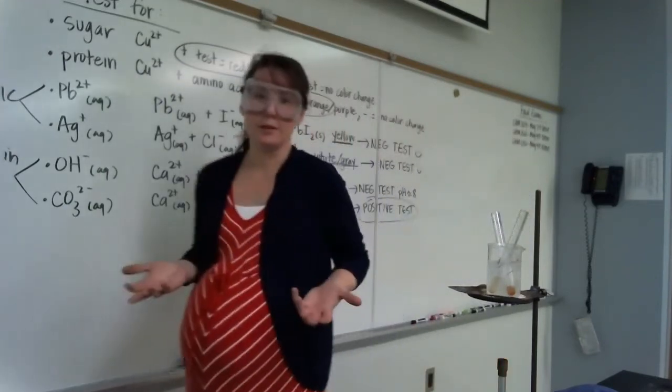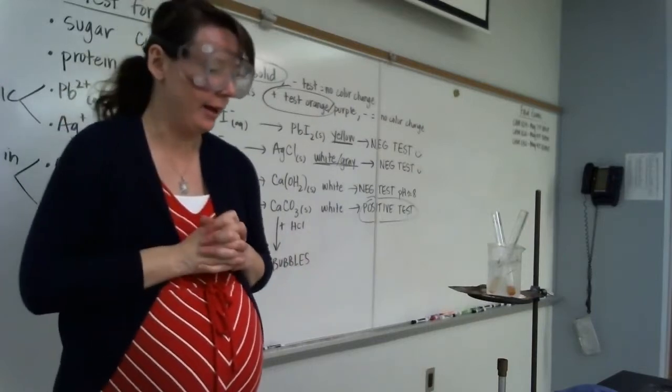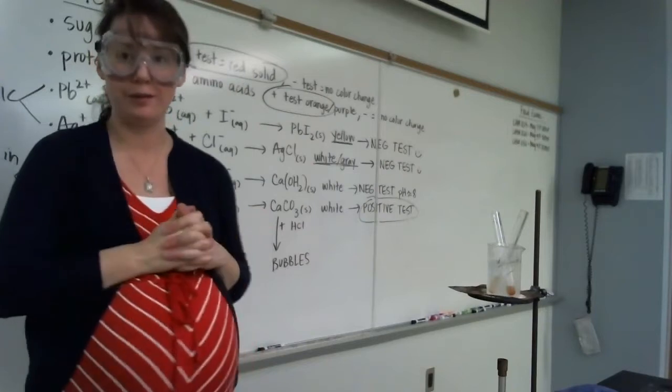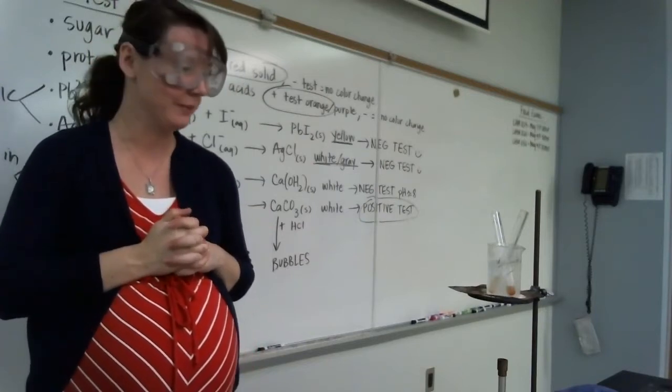So I hope this little experiment gives you a greater understanding of solubility rules and how we can qualitatively test for the presence of ions.